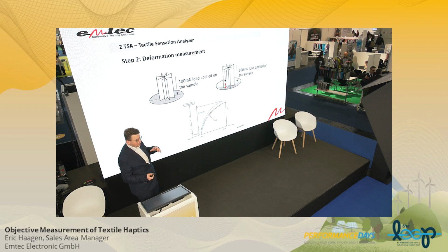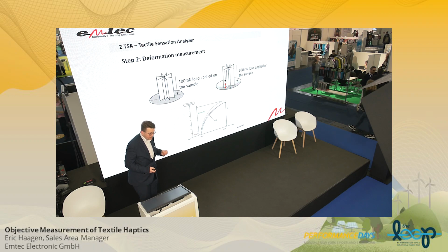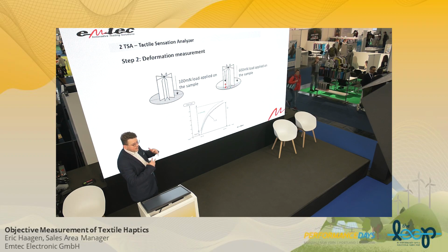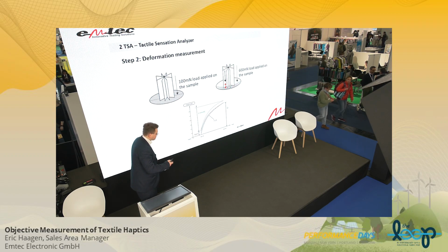Which is also important for you, this load can be increased up to 15,000 millinewtons. So if you have a stiffer material, you could also increase this load.